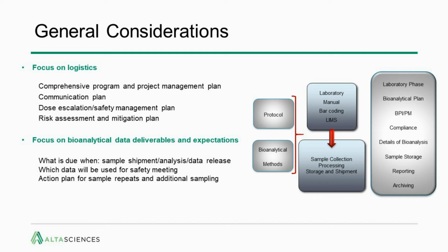PK studies and all other endpoints can change very quickly. These changes can be fast and additional sampling can be required. The agility between the first in human site and the bioanalytical teams is key to enable appropriate decision making.